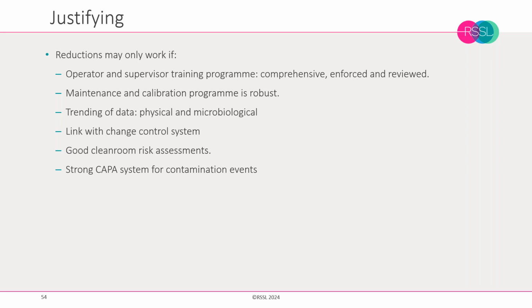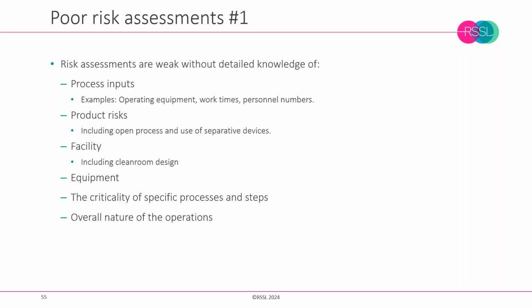So we're still doing the same level of maintenance, calibration, and cleaning, and we still have our environmental monitoring risk assessments. And it's important that we do that, because if we have flawed risk assessments, if we've got poor data inputs, or if our thinking is unclear, then we will end up with poor outputs.